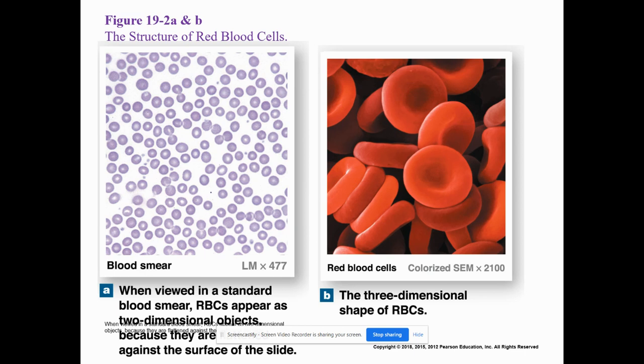So if you were in lab with me, you would see these, and we would look and see that these little tiny dots are actually platelets. Okay, the big ones that look like donuts with the little white hole, or this one, it doesn't even have a little white hole, the big ones are red blood cells. I don't see any white blood cells on this slide.